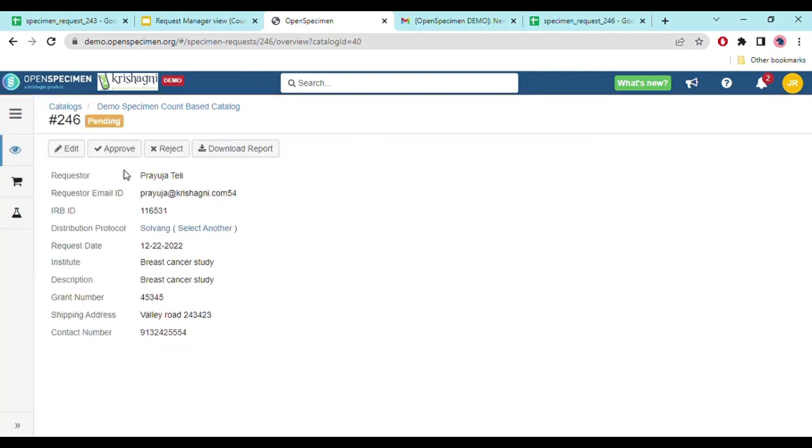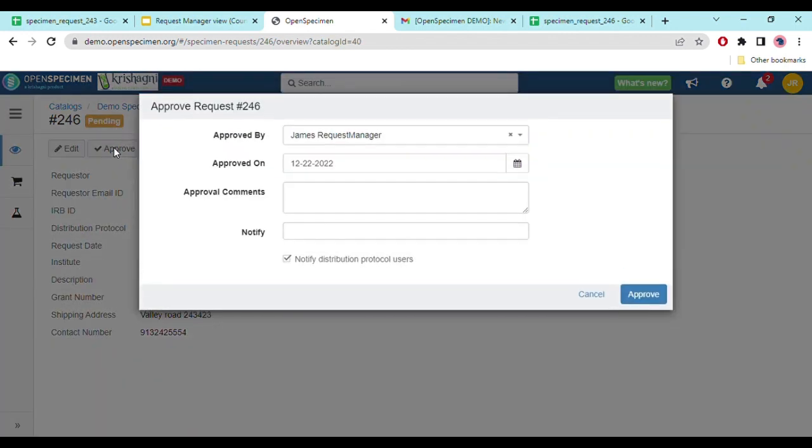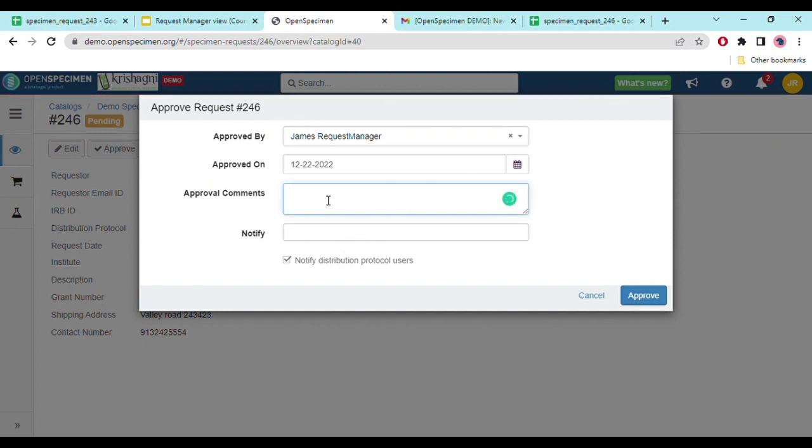Okay. Approving the request. Let me just approve the request. Now I have seen that I'm ready with this request. Okay. And approving the request.